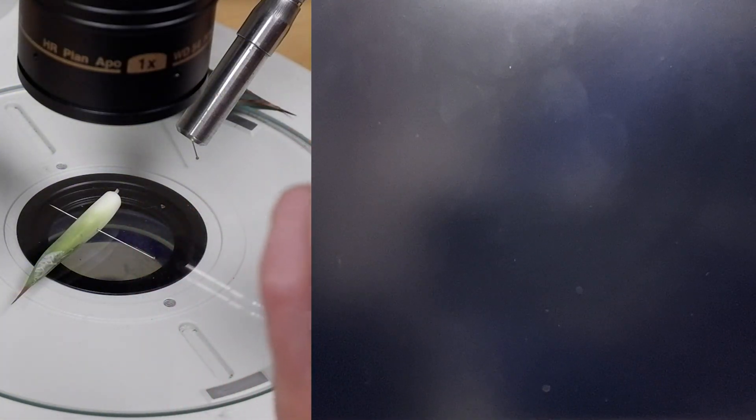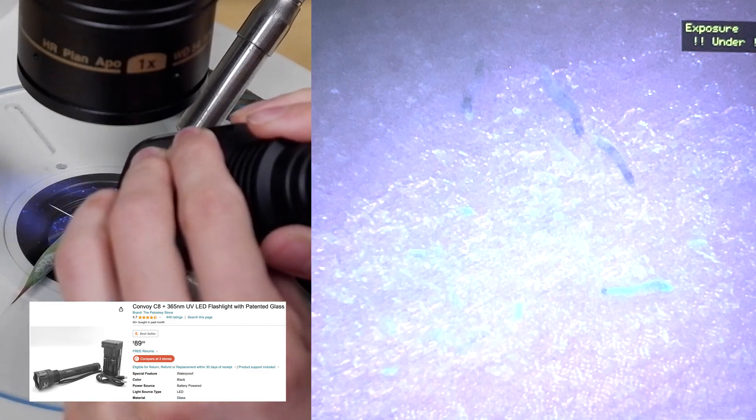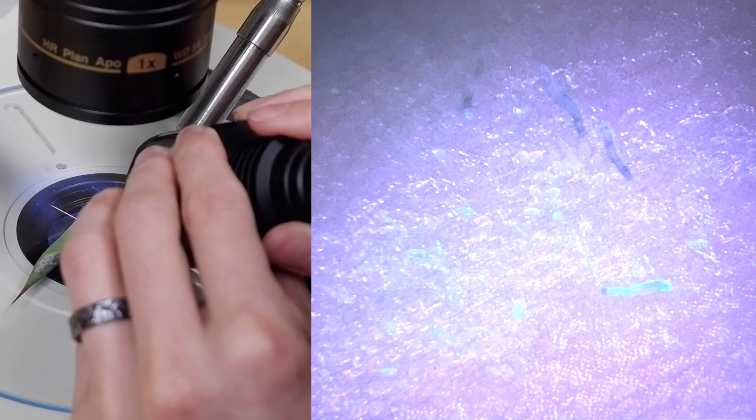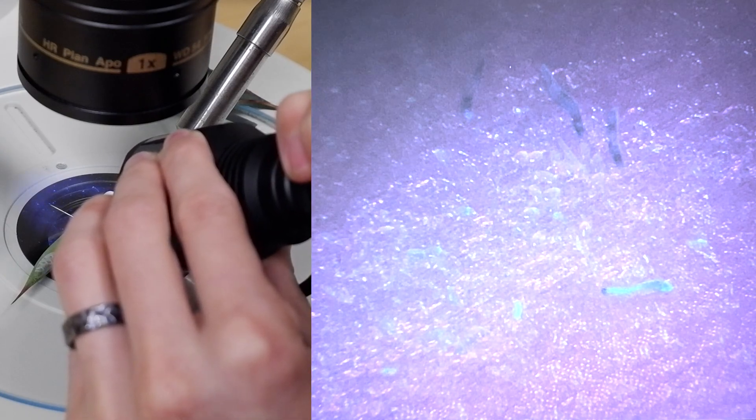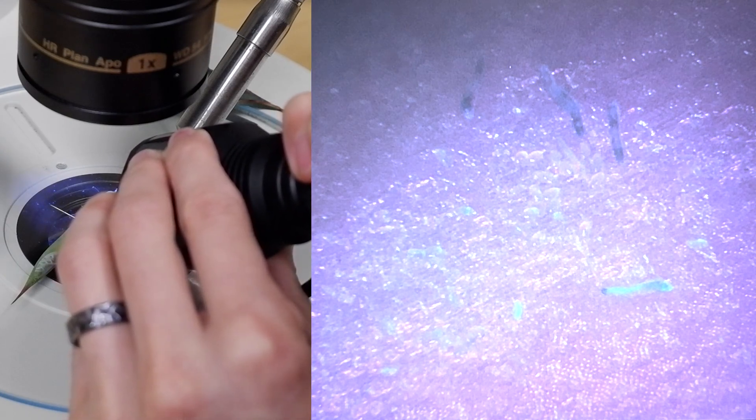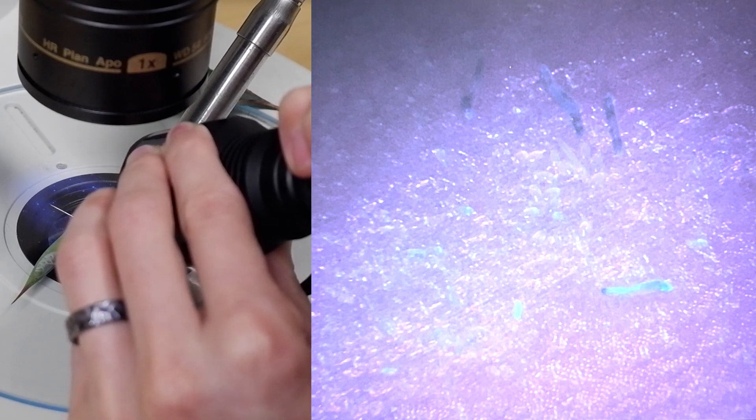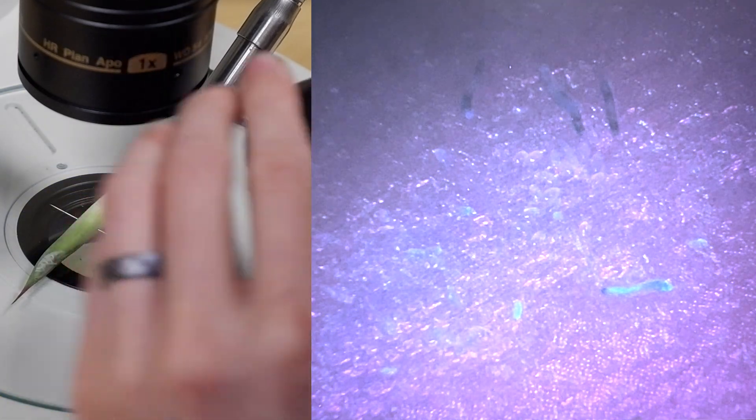Here's one that we do recommend. This is the Petoskey Stone, I believe is what it's called. You can see them a little bit better. The eggs start to pop more and the adults, you can see all of them. So this one's pretty good. You can see more of that contrast. There's more colors. There's a bunch of different colors in here that you haven't seen before. The background is more pinkish. The mites and the eggs are a bit more bluish. And that contrast makes it much easier to accurately count how many things there are.